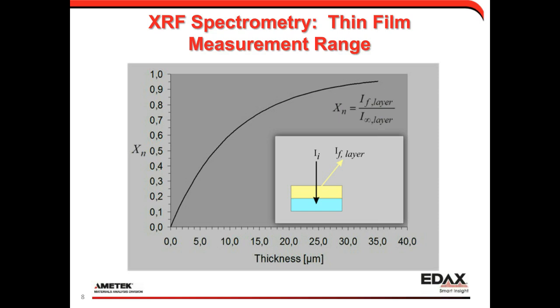That effectively defines the usefulness for X-ray: when you're too close to the asymptote, maybe around 90% of the total maximum thickness, you'll lose precision in your results because you'll be jumping around on the plot as you have small changes in X-ray intensity.